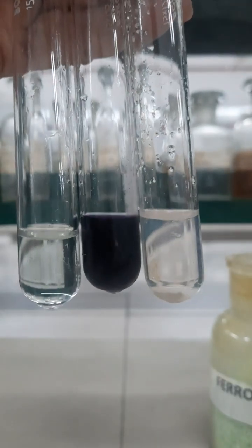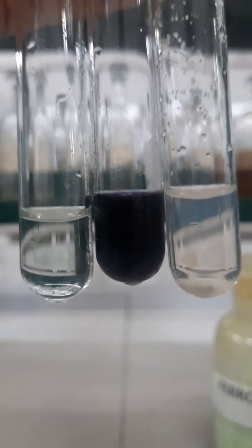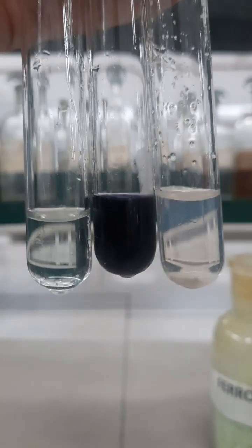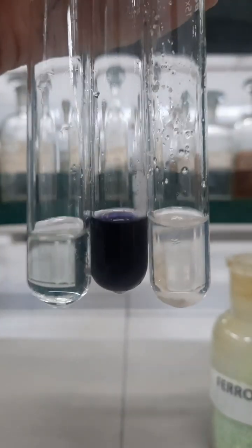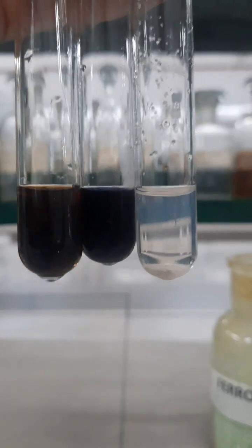In the third test tube, I am adding ferric chloride solution. After adding this ferric chloride solution, appearance of blood red color will confirm the presence of thiocyanate.